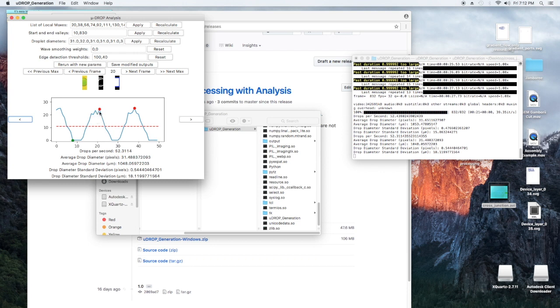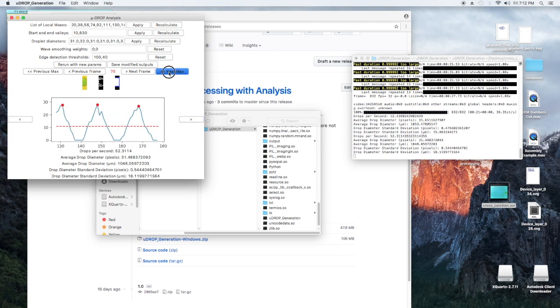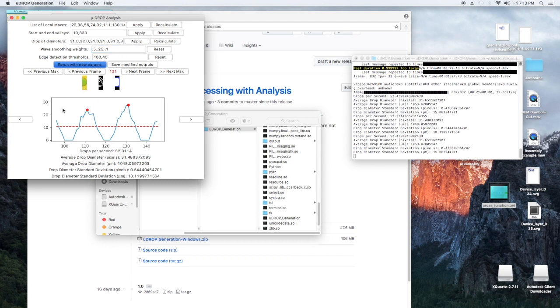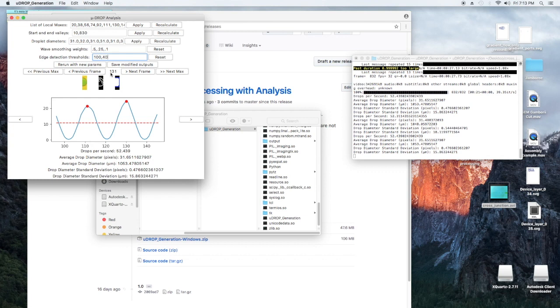But there can be accidents where a max shows up right here. So this is where you're going to, if it's something small, you can probably fix it with the local maxes. But if the graph looks as bad as it looks right here, I really wouldn't trust any of these local maxes because this is so jagged. So you might go add some wave smoothing to this. So we'll do 0.5, 0.25, and 0.1. Rerun it with those params to get a nice, smooth graph. And this is, you can look on Wikipedia for the definition of how this works, but this is just your basic moving weighted average. So triangular wave smoothing, you hear it called.